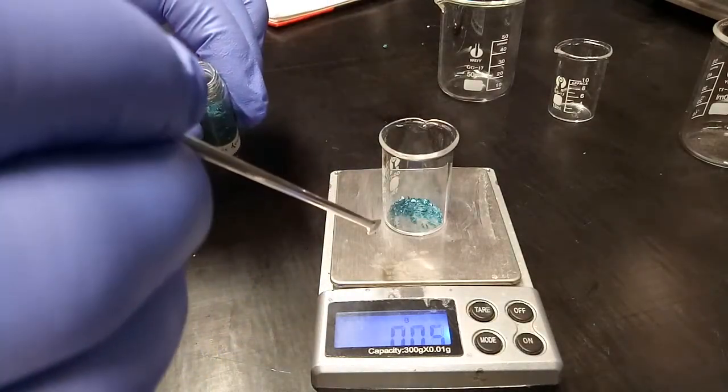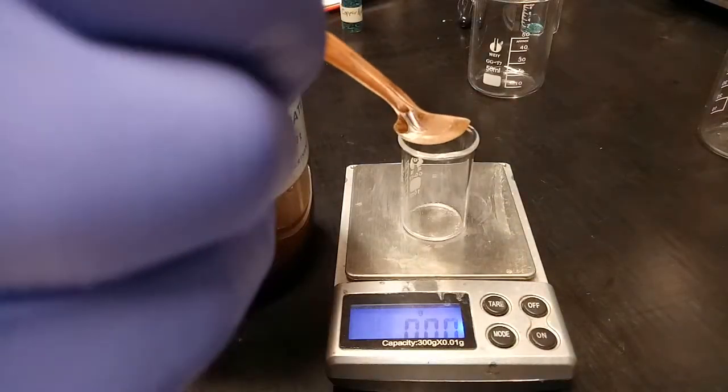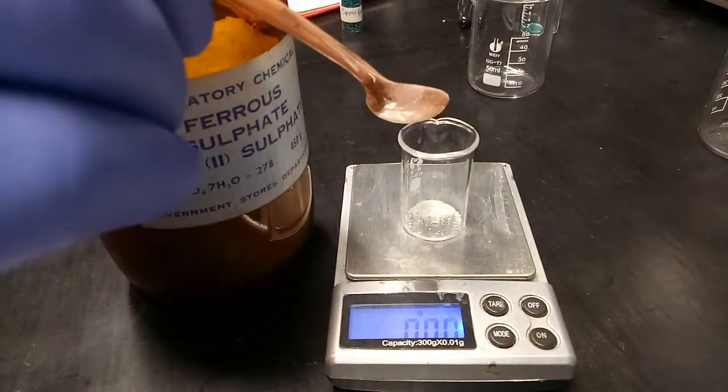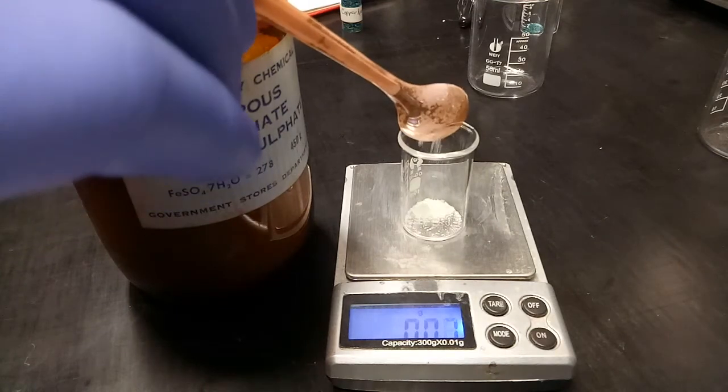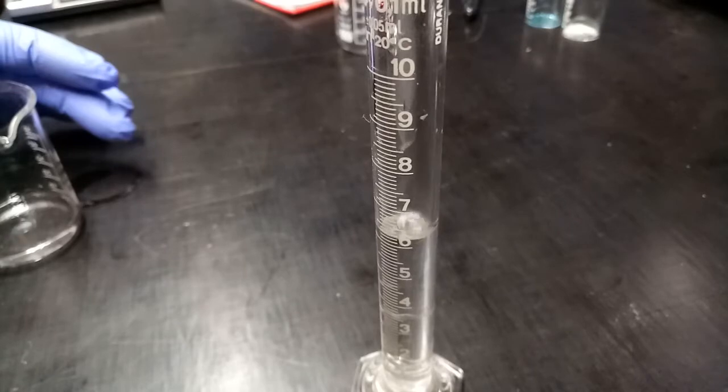Now I won't pretend I understand the mechanism behind the reaction. It is an oxidation, but beyond that I'm not really sure what's going on with the two catalysts that he used. We've got about 0.1 gram of copper acetate and another 0.1 gram of ferrous sulfate used as a catalyst.